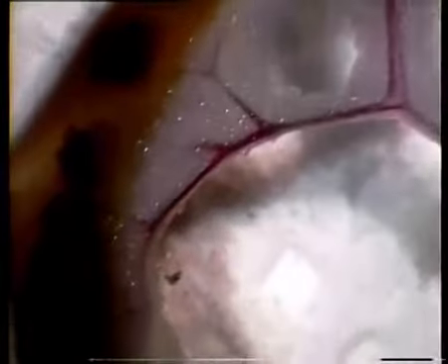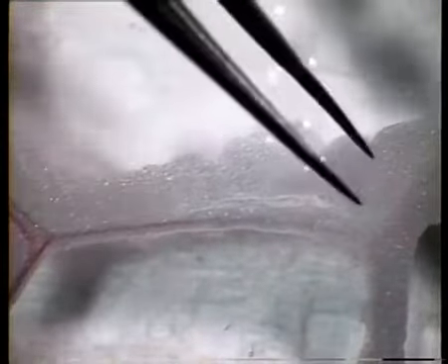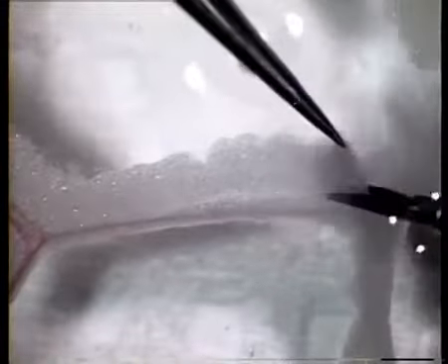Note that by turning the petri dish, you can cut with the scissors at about the same angle all the time. During the coarse dissection, you should not get very close to the vessels. Throughout the whole procedure, do not grab any part of the vessel that is going to be used. Avoid cutting or pulling on the vessels or the vessel wall.